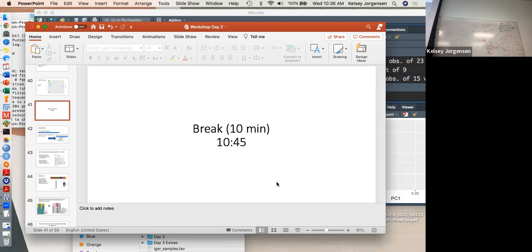So now it's happy. So now you can do this one. There you go. I just like watching it load. It's so satisfying. It's very quick. So now if you look in your folder, right here, it should work. If you reload it. Yeah, there you go.